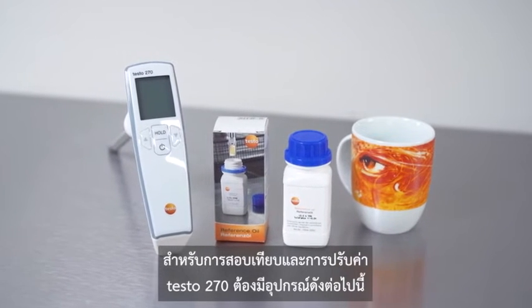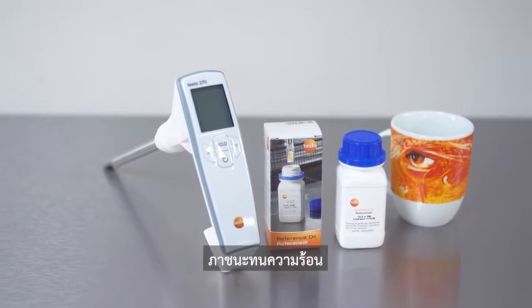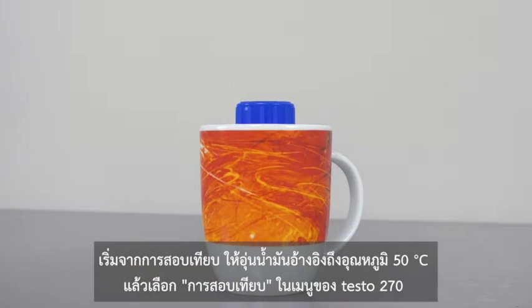For the calibration and adjustment of the testo 270 you need the following: the testo 270, the testo reference oil, a heat resistant container, and hot water. Let's start with the calibration — to do this, first heat the reference oil to 50 degrees Celsius.